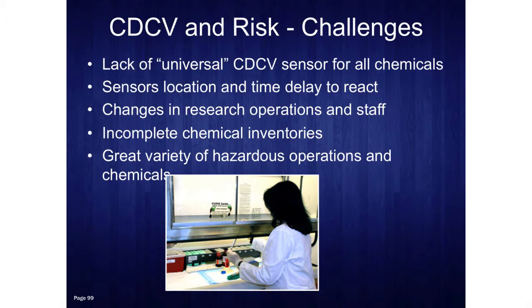Other challenges that EH&S professionals face is the change in research operations, changes in inventories, and there's always a never-ending variety of operations and chemicals to reassess. That benchtop assessment that Mark was referring to, obviously it takes a lot of manpower to do those assessments, and the reassessments have to occur when there are changes in the lab.